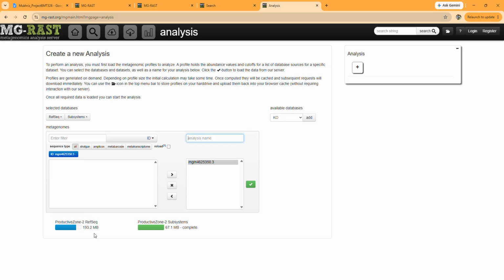Okay, we almost finished with the analysis, but it's still running.